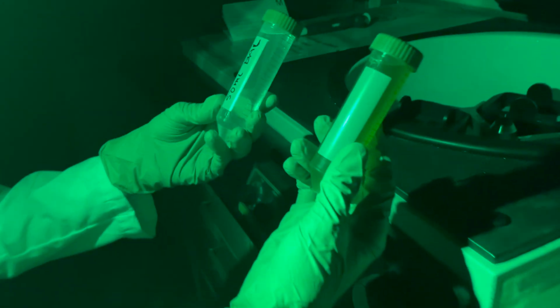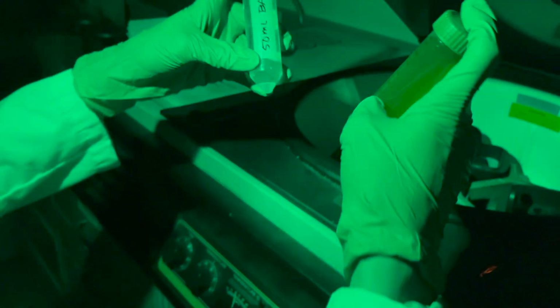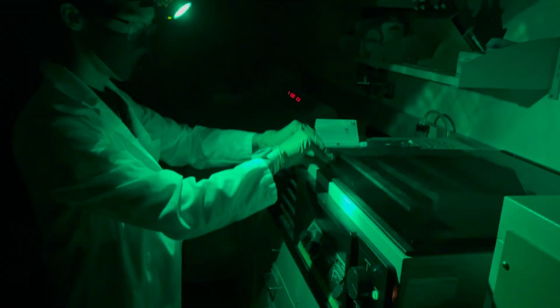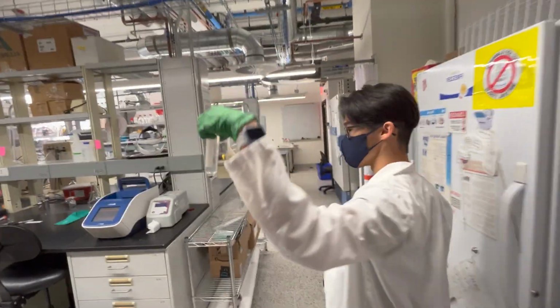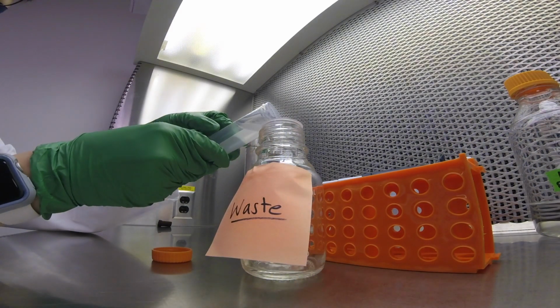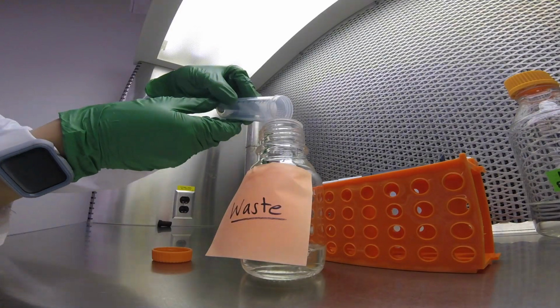2. Transfer 30 to 50 ml of your cell cultures in tap into 50 ml falcon tubes and centrifuge them at 3500 G for 10 minutes. The resulting pellet should be easily visible and fully condensed to the bottom of the falcon tube. 3. After centrifugation, discard the resulting supernatant in a waste beaker. A dark green pellet of C. reinhardtii cells should remain at the bottom of the tube.